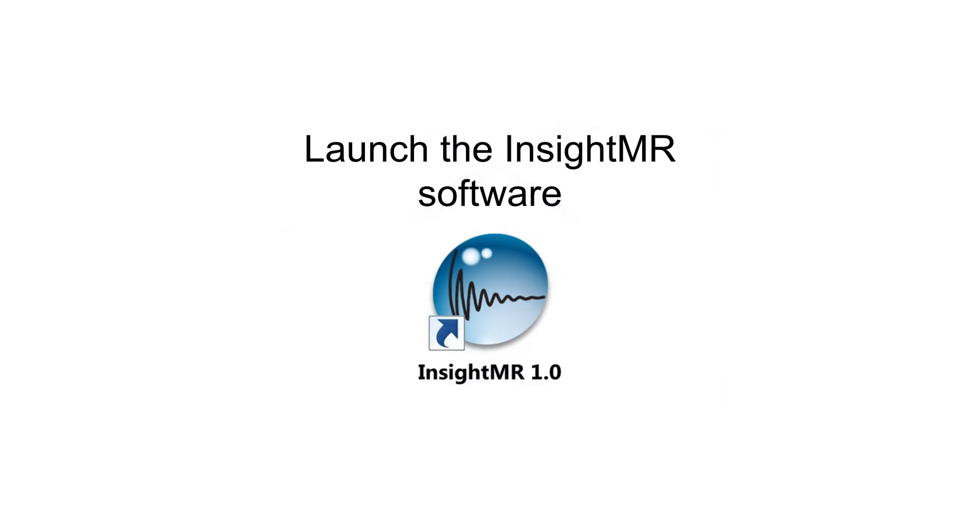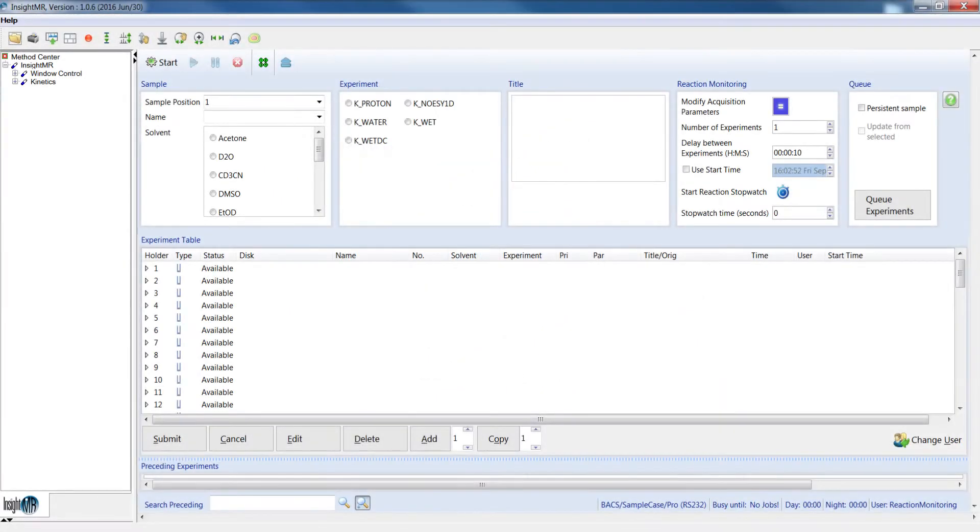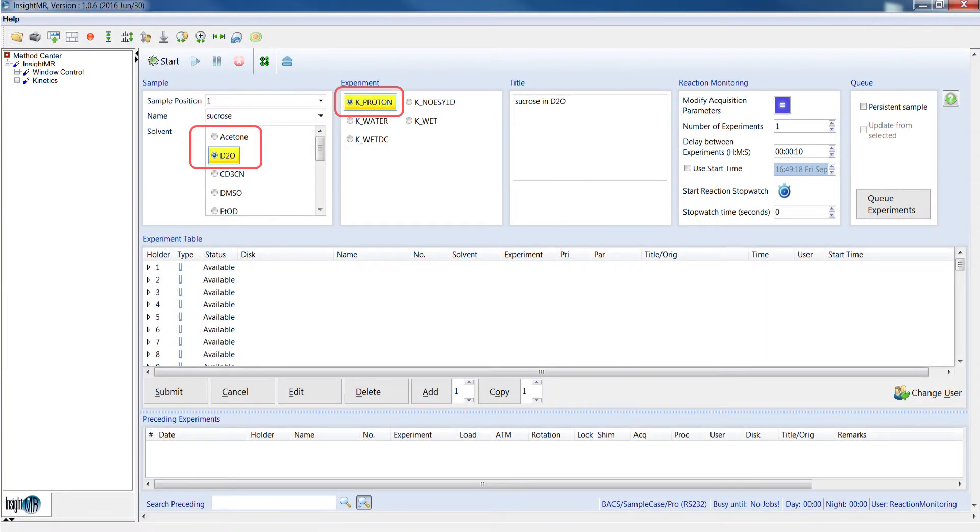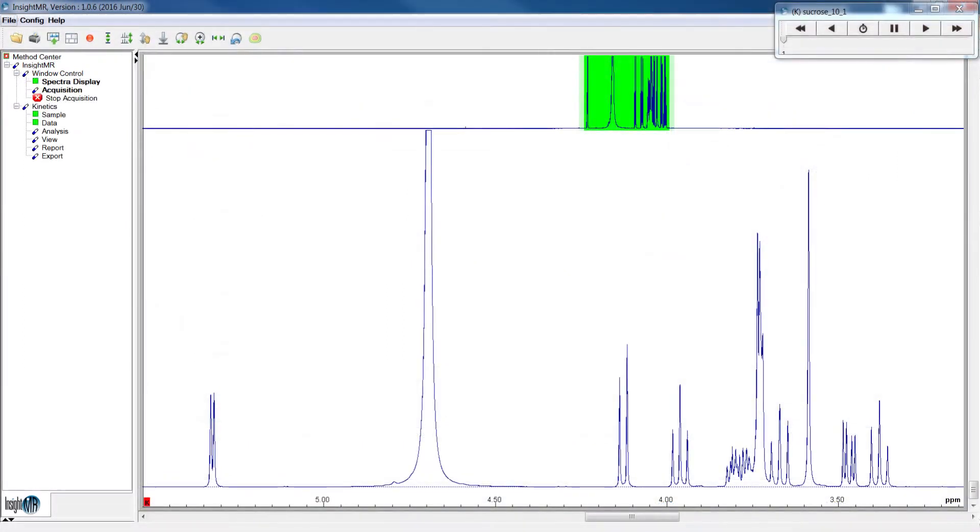Then launch the Insight MR software and acquire a Proton MR spectrum with any known 5mm sample in a deuterated solvent, simply to ensure that the spectrometer is locked and is working properly.